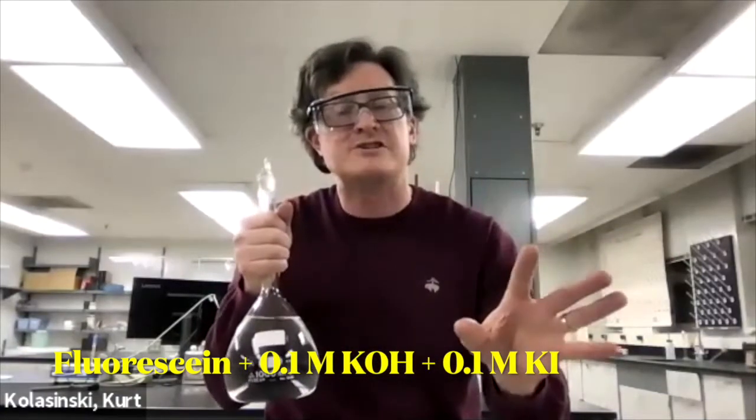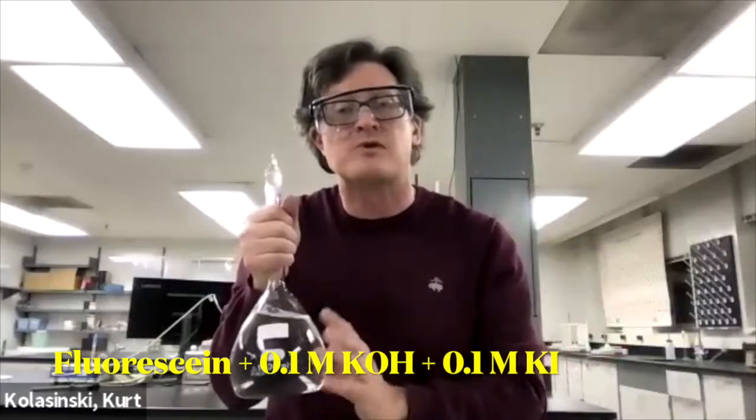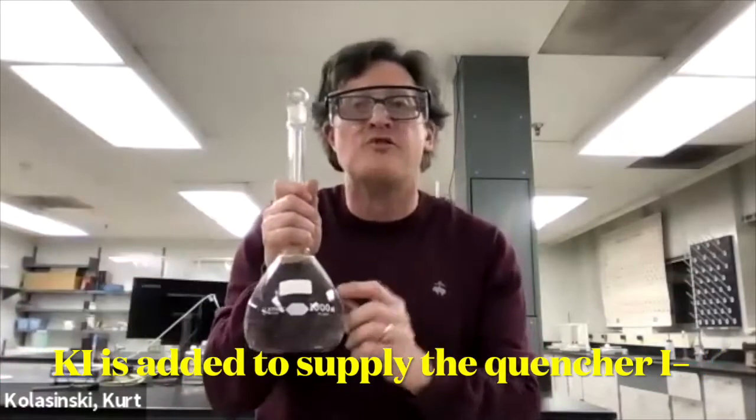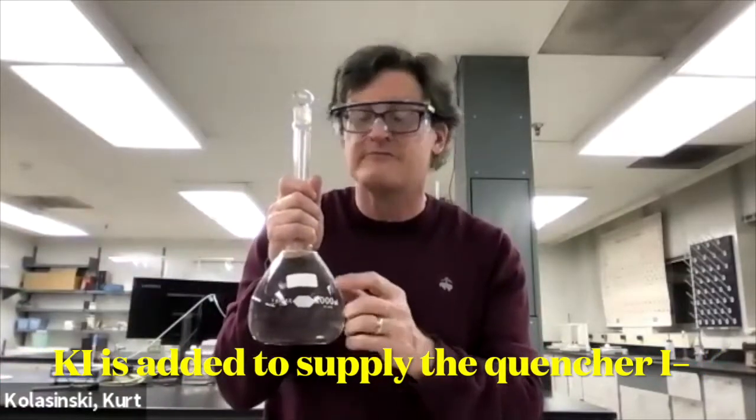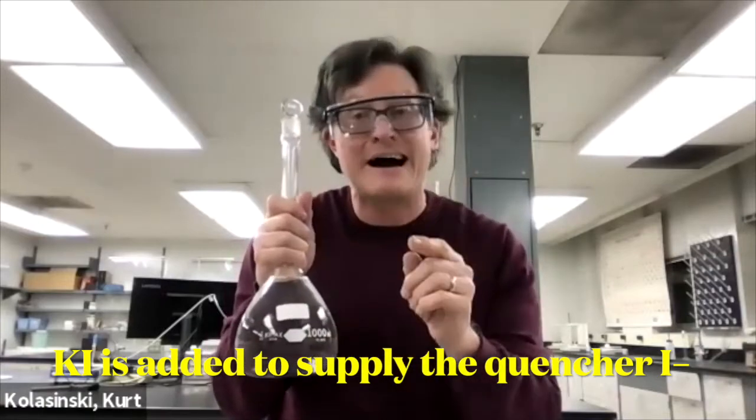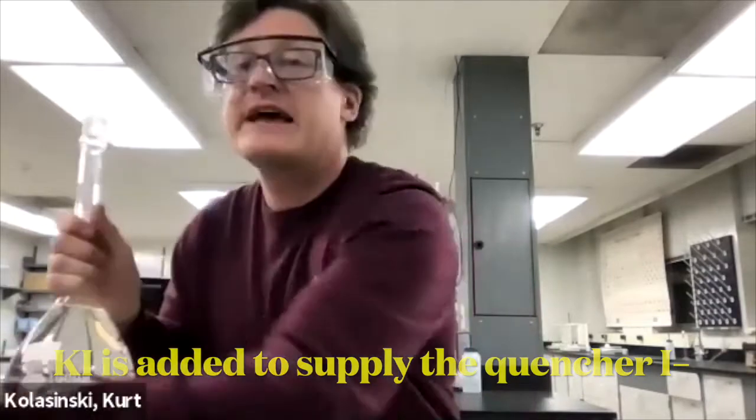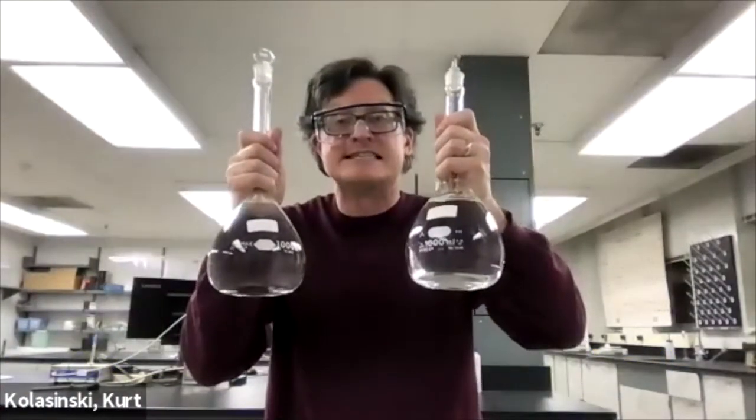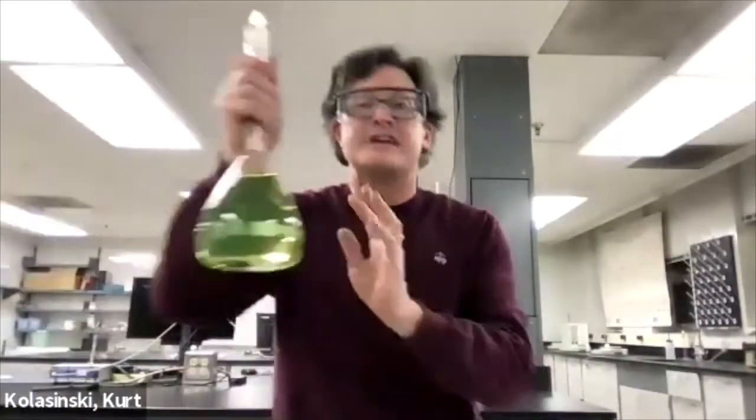Turns out the fluorescence depends on the pH. We need to control the pH. We're going to make this basic pH with 0.1 molar KOH. We're going to keep the K plus and the OH minus concentration constant. So we're going to add varying amounts of 0.1 molar KOH with 0.1 molar KI.